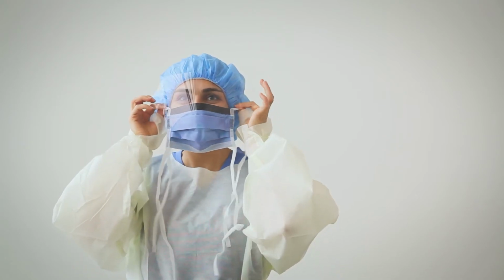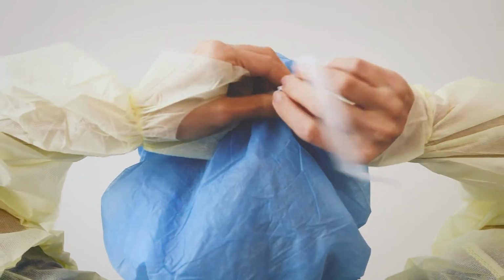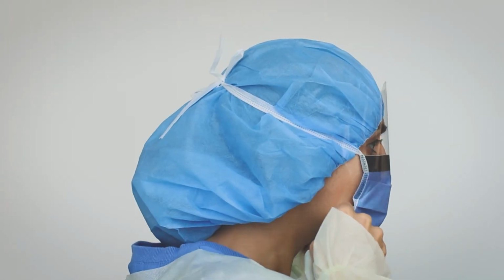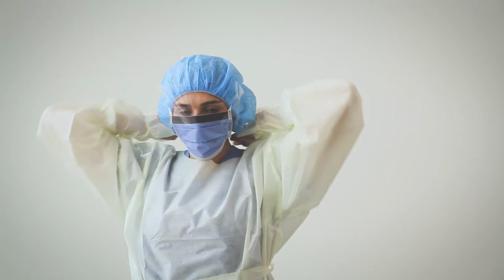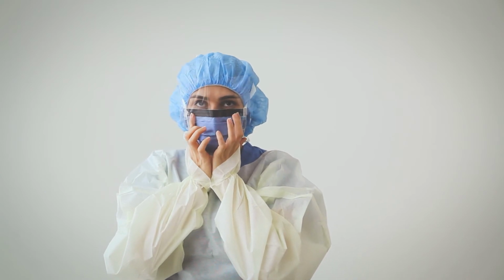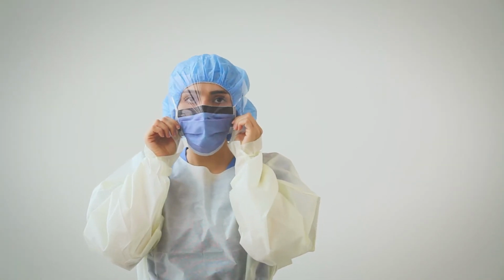With the mask positioned comfortably on your face, fasten the top tie at the crown of your head and the bottom tie behind your neck. Slide your fingers under the bottom of the visor and press the nose piece along the nose and cheekbones to ensure a secure fit. Adjust the visor as needed to reduce glare.